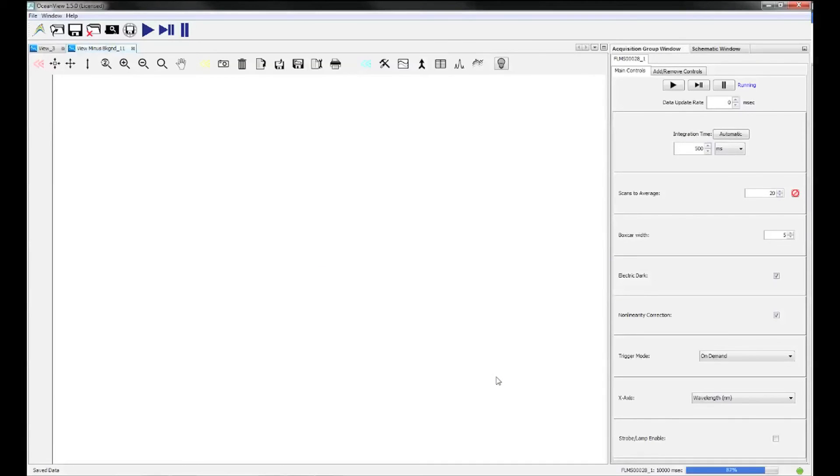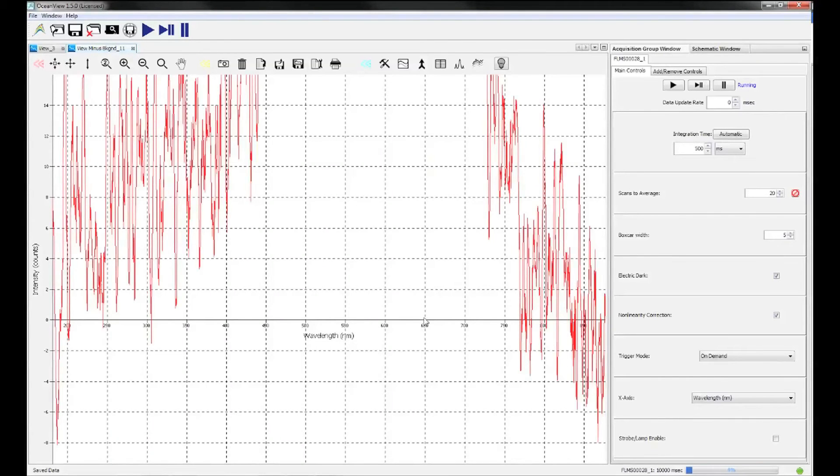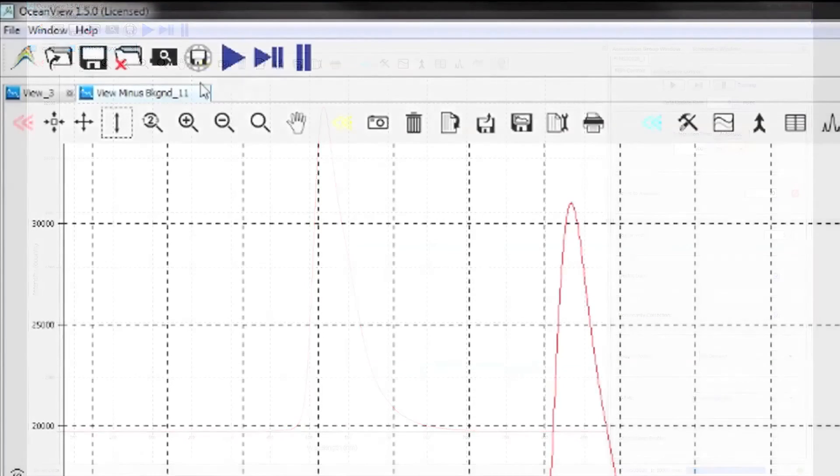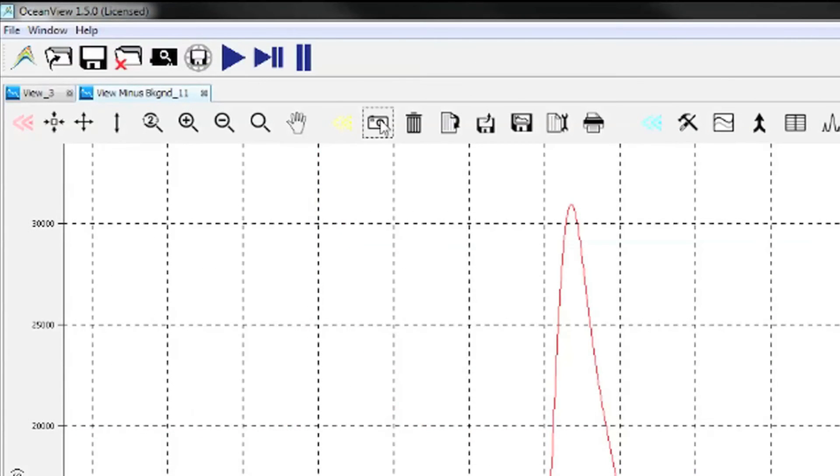Switching your light source back on, your fluorescence measurement can now be seen in the view minus background tab. You can capture the current spectrum using the camera icon at the top of the screen.